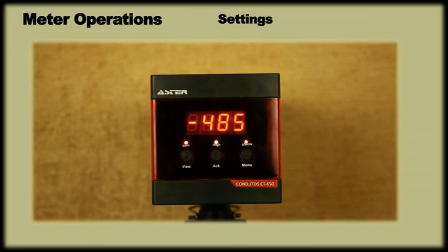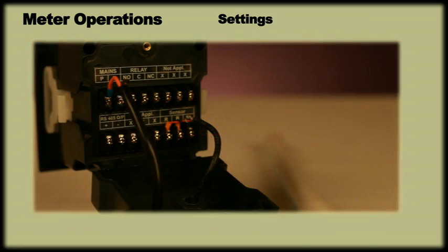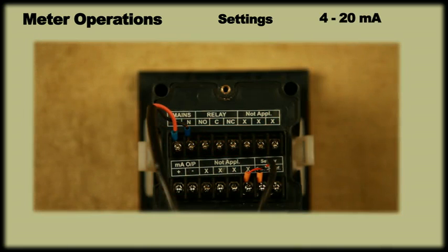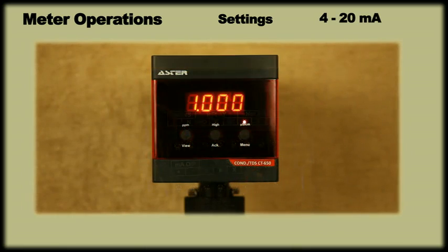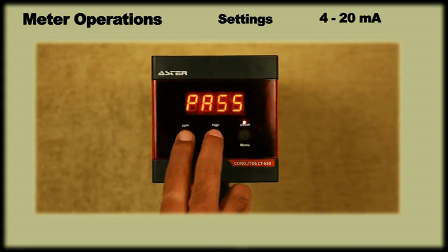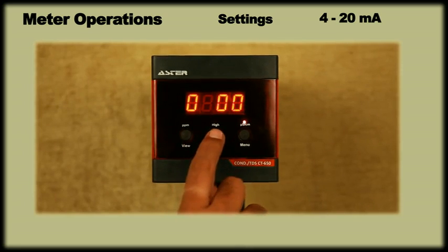As mentioned earlier, the meter is available with an optional output of either RS-485 or 4-20 mA. Let us first understand the settings for 4-20 mA. In case your meter has 4-20 mA output, the default 0 and span setting can be viewed by pressing View key. In case the factory setting of 0 and span needs to be changed based on the process requirement, press View and ACK key simultaneously and enter password 0678.